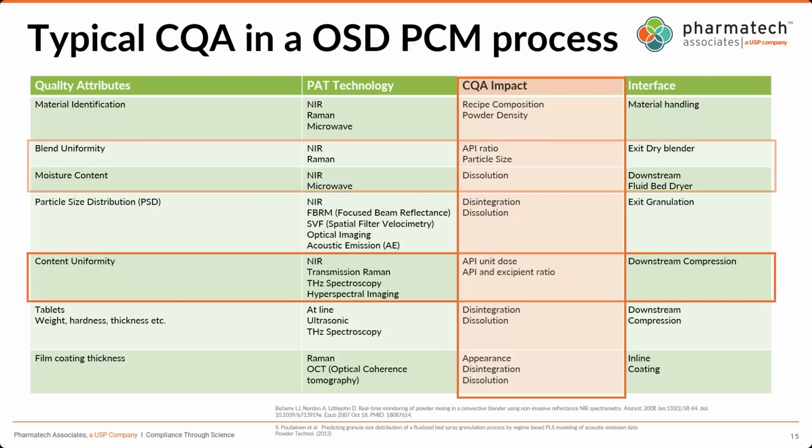But beyond that, I would say only blend uniformity, moisture content. Given my background and experience with this kind of technology, I think for these areas, you see really reliable technologies which have been implemented to a level where they are not, let's say, compromising a continuous process when it runs longer than a day.